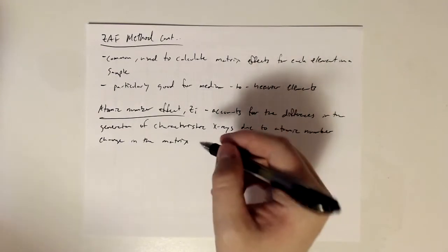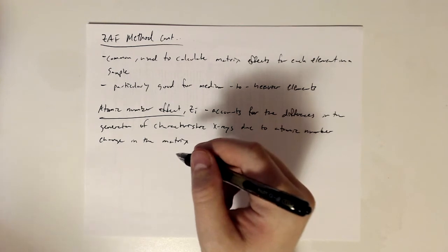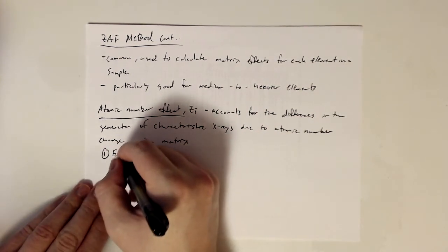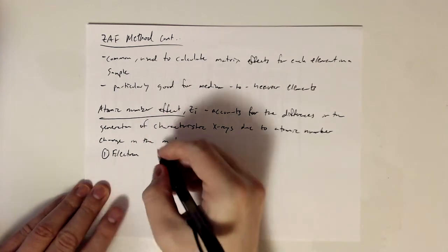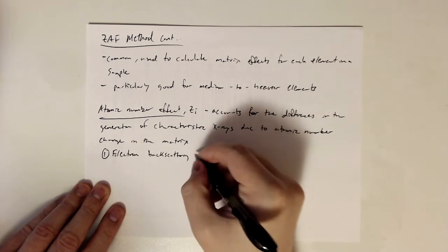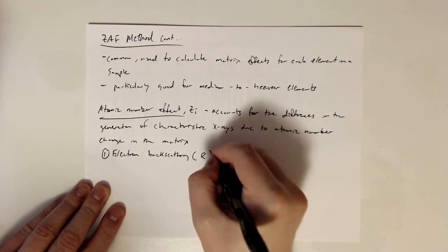This itself also has two factors. The first being electron backscattering. We call this R.